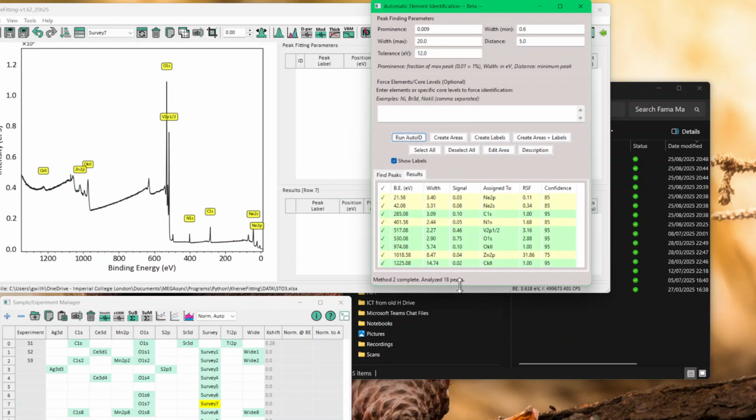But now, let's say now we know we have vanadium. So let's just put vanadium, and now you get all the peaks in here, but you didn't see this peak here. And that's definitely sodium. We know because we have sodium 1s and sodium KLL. So just add Na. And now you have them all together. You can just do Na1s. And this will just look for Na1s in here. Okay? And so that's how it works.